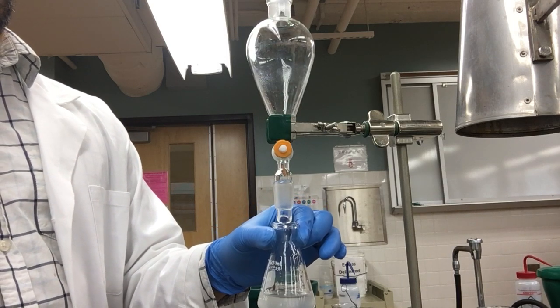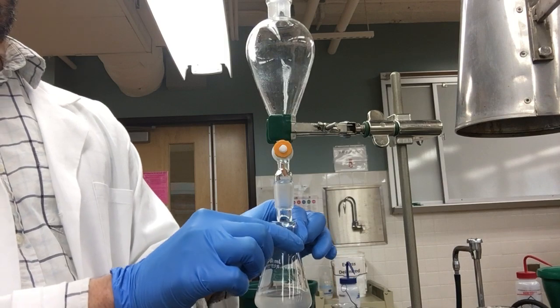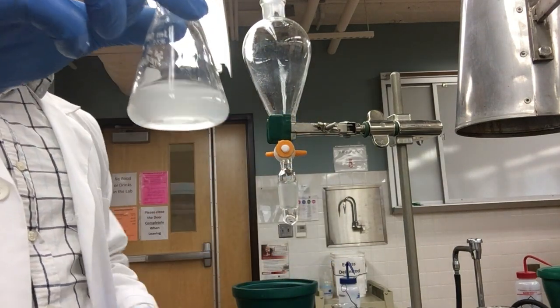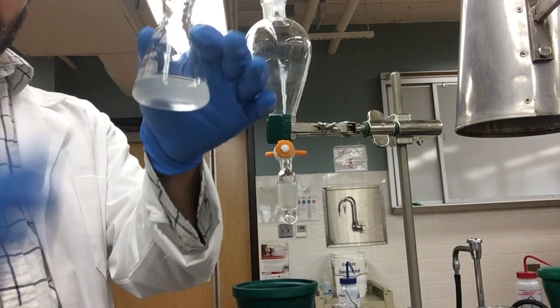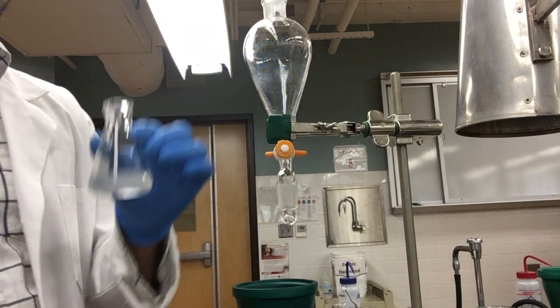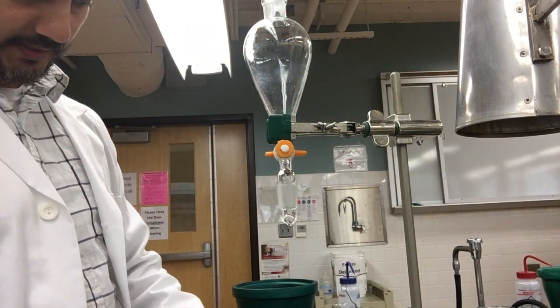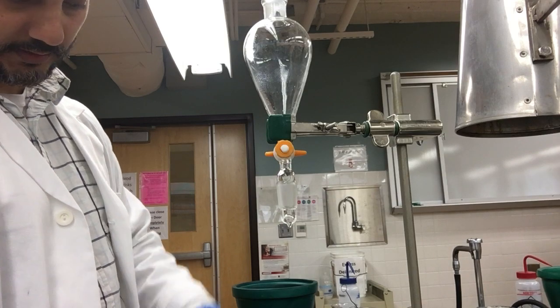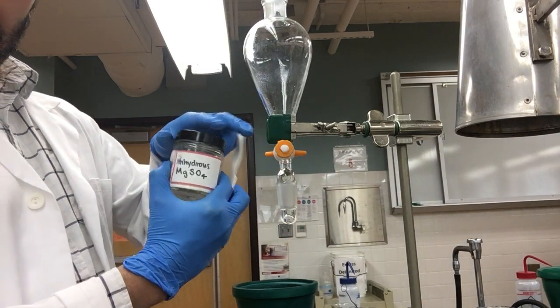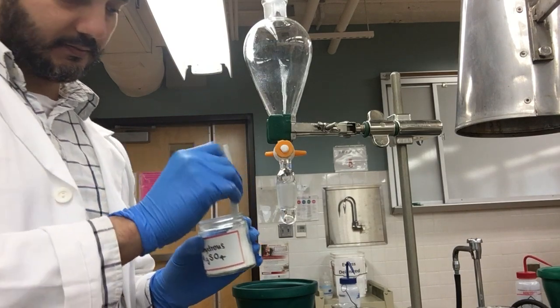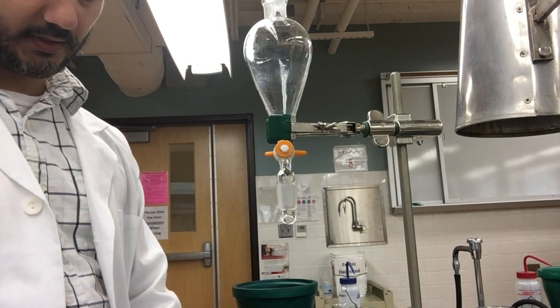As you can see, it is cloudy once again. What we will do is add a little bit of the drying agent that we have here to this organic layer. Magnesium sulphate or sodium sulphate can also work.